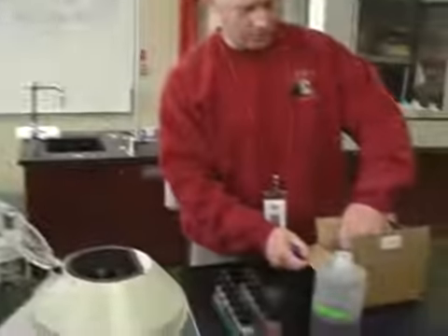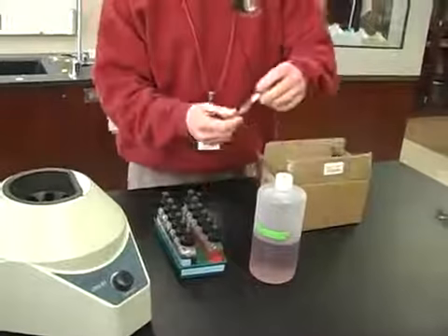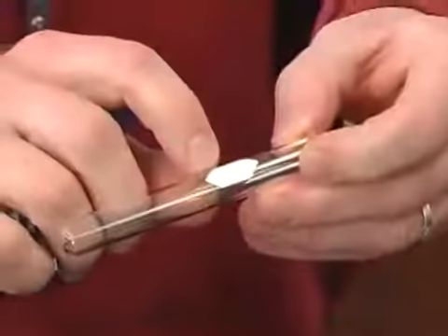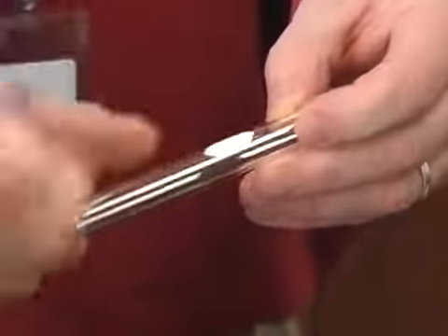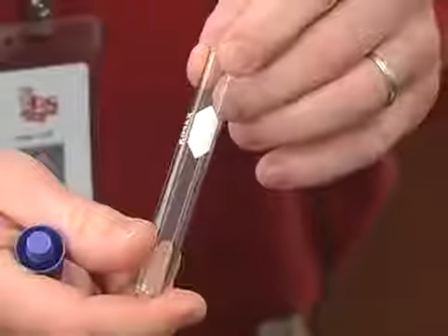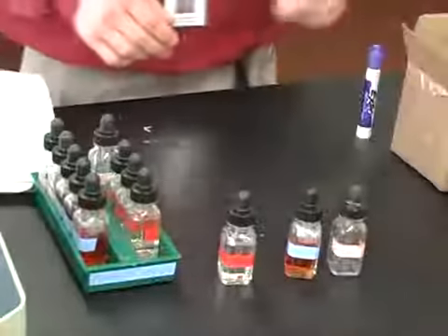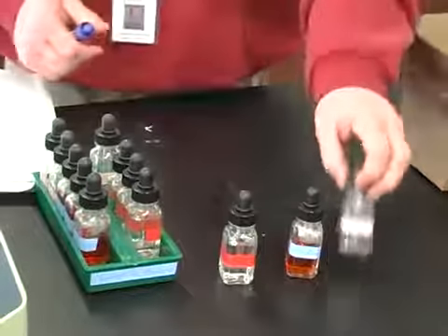See, these are the test tubes that you'll be using. And you can see that there's a small little white box on there. And if you use a pencil, you can write on there and it won't come off in the hot water bath because sometimes you have to heat it. We'll show you some of the other equipment as we go along as well. These aren't filled yet because we're not going to fill them until right before the lab starts.